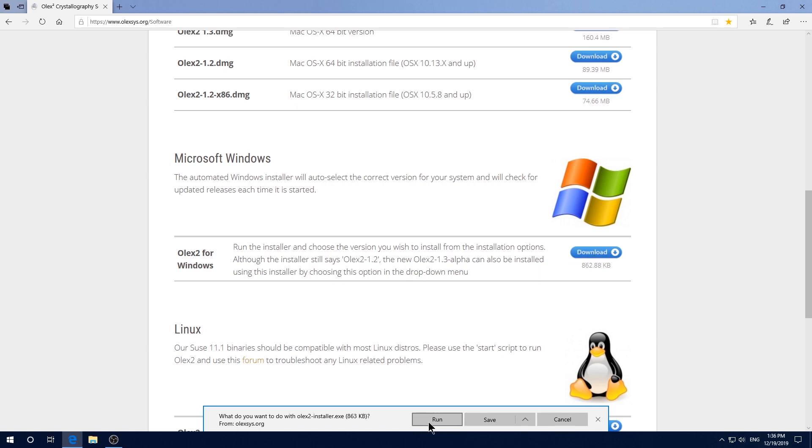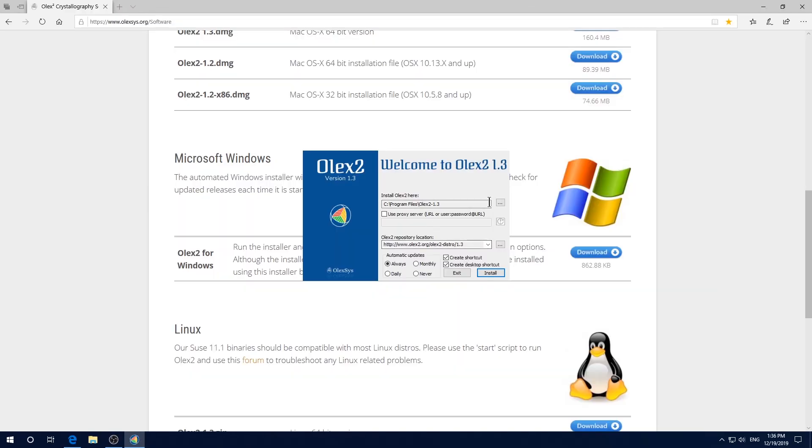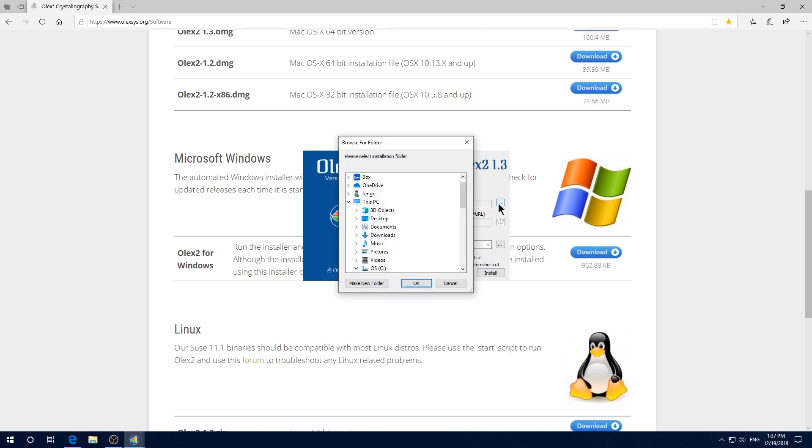Then click run. Then click yes. Click here. You can choose a different location to install. But you can definitely accept the default location. However, you need to know the exact location where you are going to install. So either write it down on a piece of paper or take a snapshot of this screen. I'm going to install to drive C for the purpose of this demo.